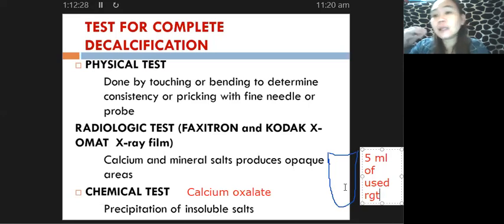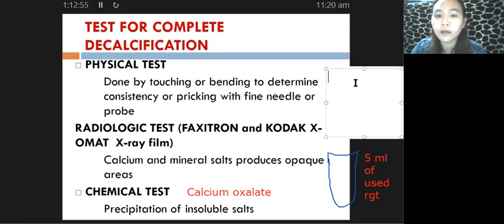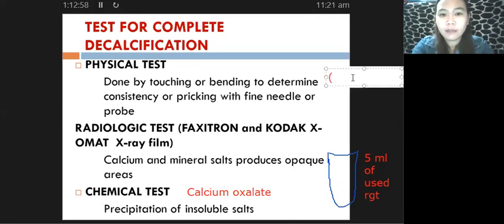In the process of alkalinization, you would already be able to observe if calcium salts are present or not. After alkalinization, watch whether a precipitate forms. A positive result for the presence of calcium salts is the presence of precipitation.